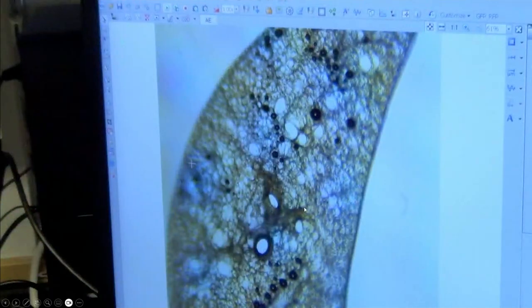And this is how it will look under microscopy. You've seen this slide. You'll have here lung parenchyma, and you'll have a smooth muscle ring. You might have a blood vessel. Now, what this slide shows is I had some bubbles in my injection, so this is good for illustration. This was one of my first slices that I did. If you haven't completely purged the air out of the syringes and tubing when you're doing the injection, you might get some bubbles, and these are unwanted.